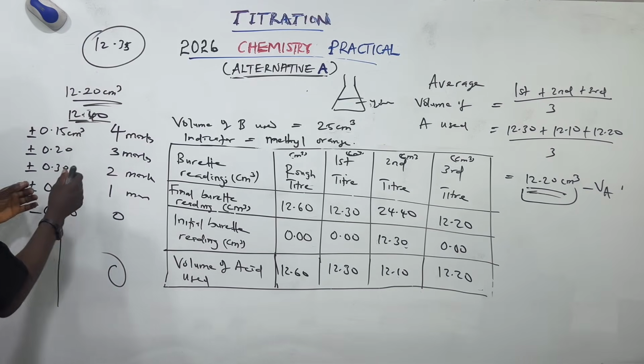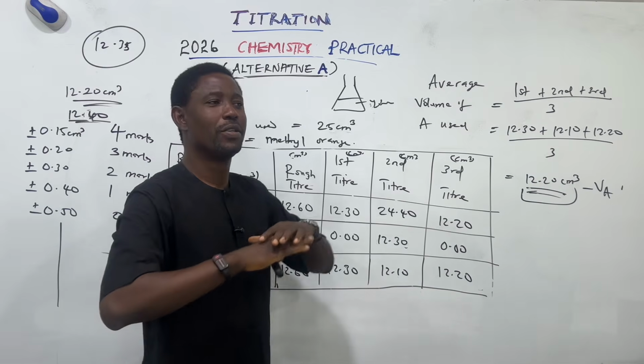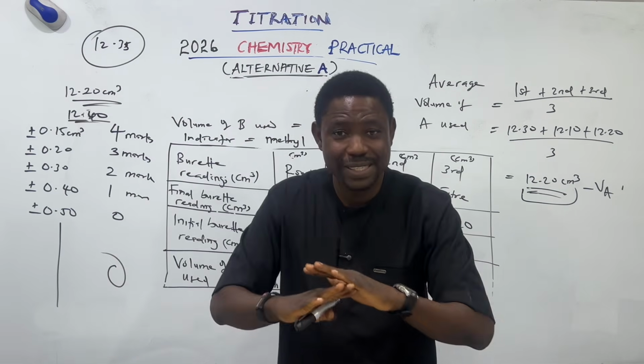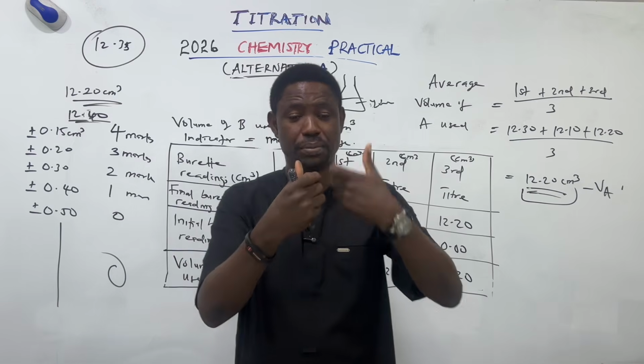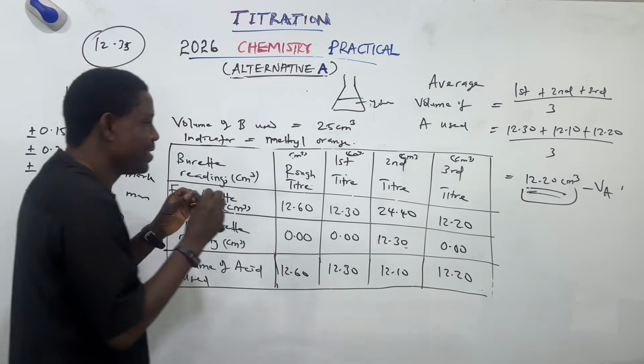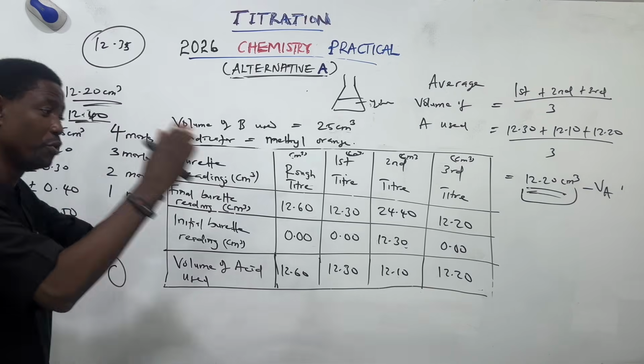All you need to do is transfer and measure accurately. Make sure your pipette is good and not broken, so that the volume will not change. The burette is not leaking. Use the required drops of the indicator. As your teacher told you, use 2 drops.